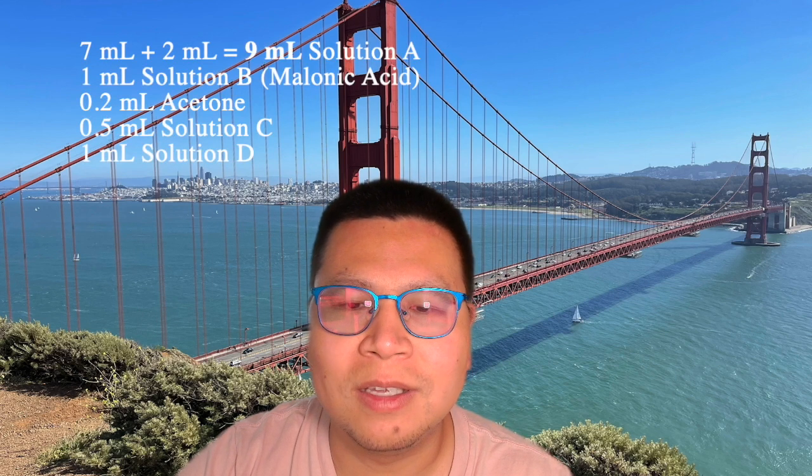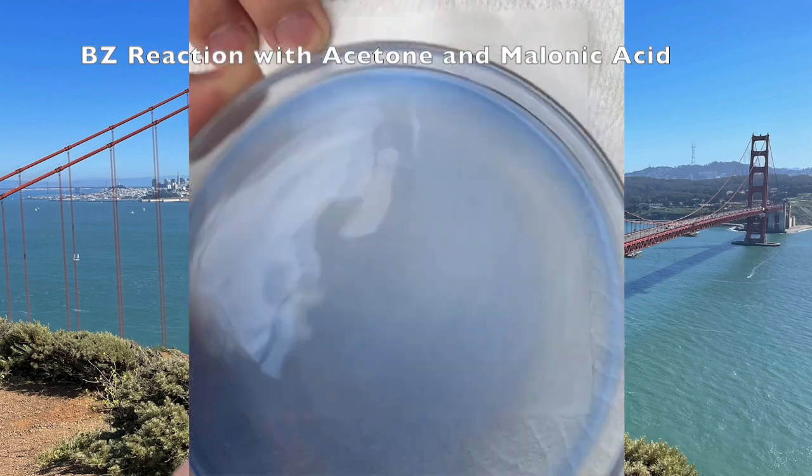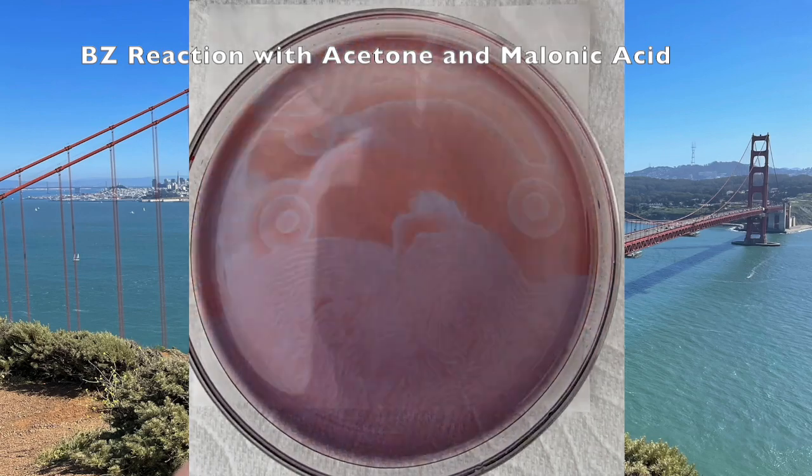After the solution becomes clear, my chemical instinct tells me that the acetone will consume a small amount of bromine, so I added an additional 2 ml of solution A, which is the sodium bromate. It should be noted that the reaction between acetone and bromine should be far slower than that between malonic acid and bromine, so the malonic acid should still be the main ingredient responsible for the BZ reaction if the reaction occurs at all. In this video, you are witnessing the reaction from a time-lapse video.